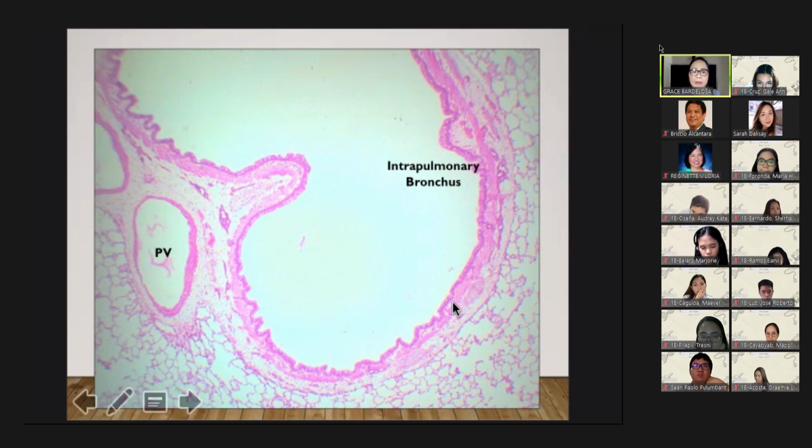And in the lamina propria, you can see here thin and elastic smooth muscles. Okay, so what you see here are thin spiral bands of muscle, smooth muscle cells here. That is what we will see in the lamina propria.